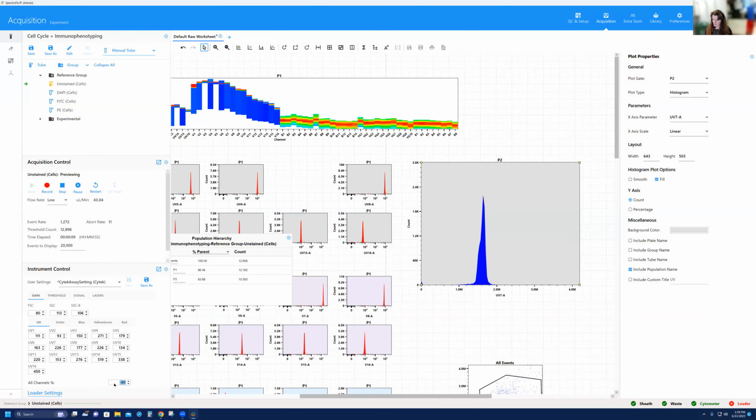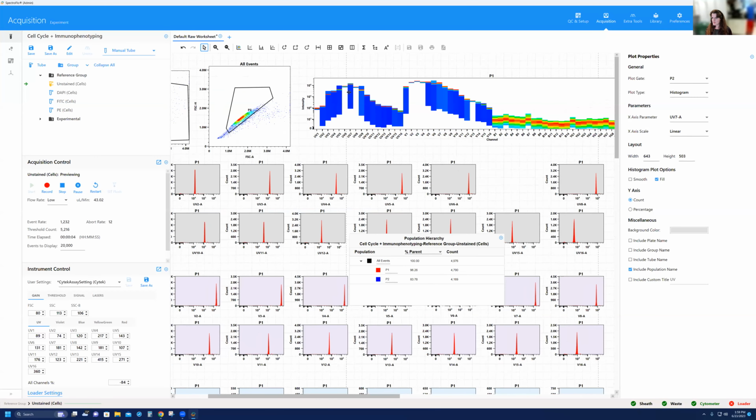Okay, we can see the signals on scale, but I want to bring it down a little bit lower. So I'm going to bring this down to maybe -83, -84. Okay, and then if I come back over here, what can we see? Our UV is on scale.